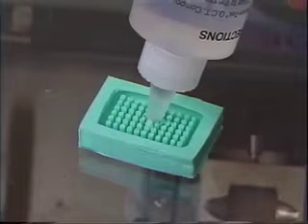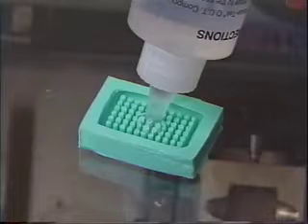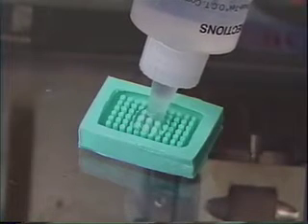Simply pour the OCT compound into the mold, taking care not to force air bubbles into it. Air bubbles will cause unwanted air pockets in the OCT array.